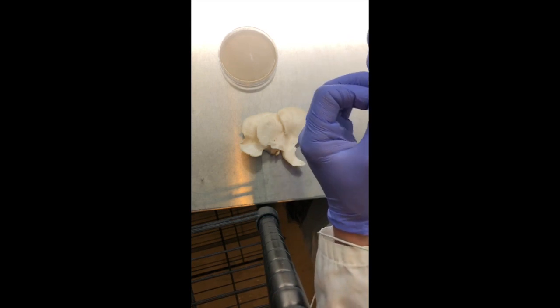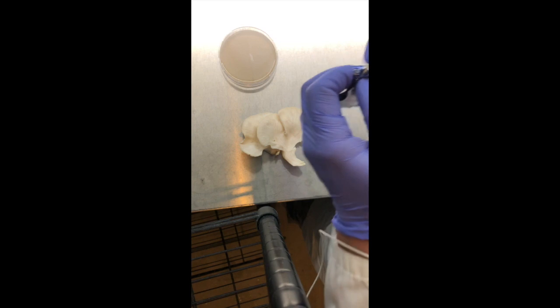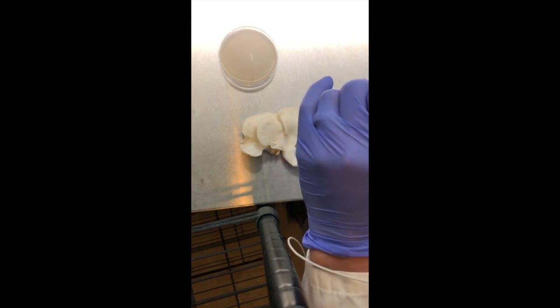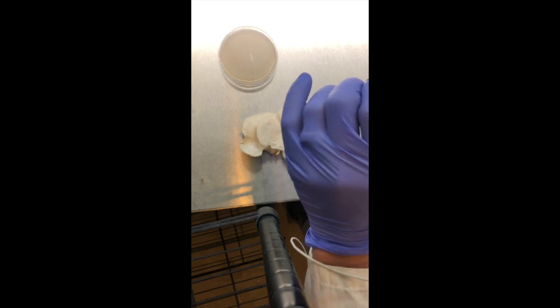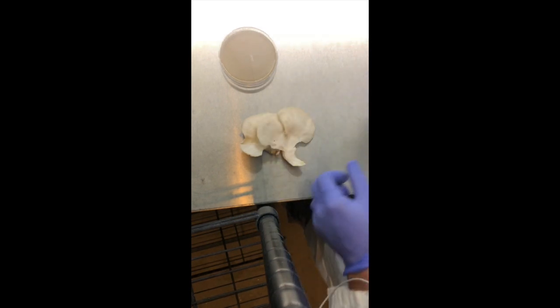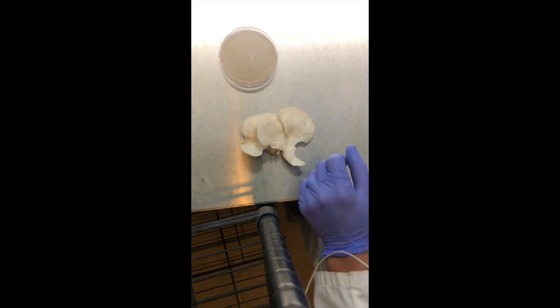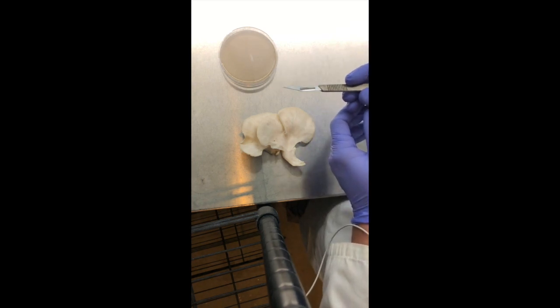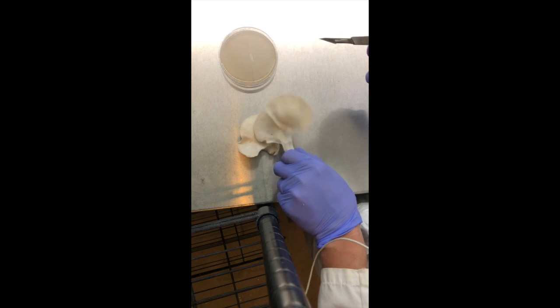Right now I'm opening up a sterile blade — a number 10 — which is my favorite because of how it's shaped. It's perfect for grabbing the tissue. See the bevel, it's nice and pointy so I can make accurate cuts.